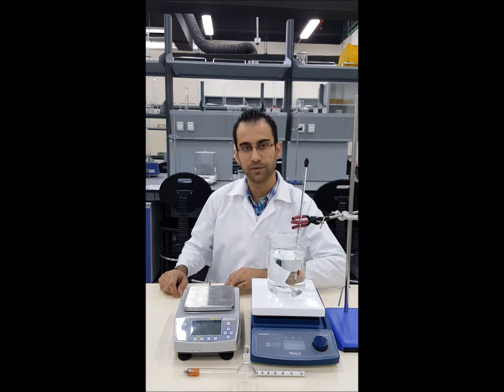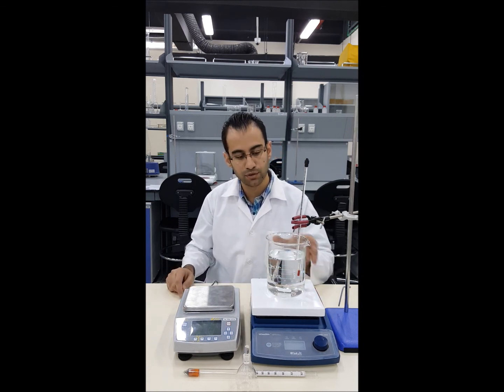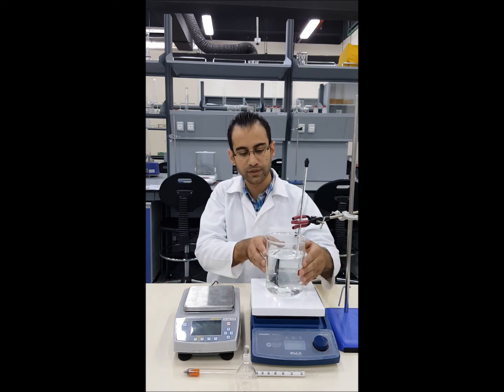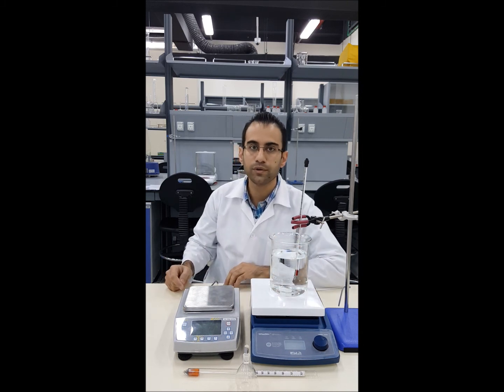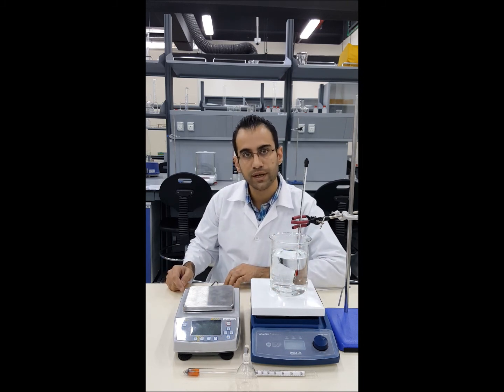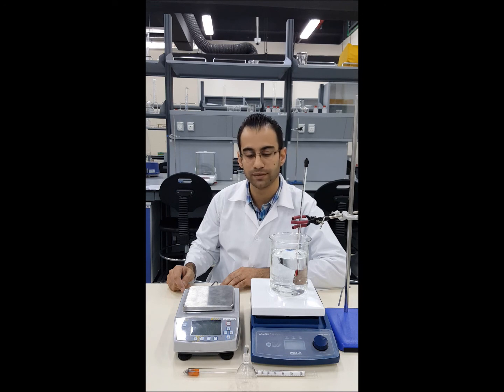For this experiment we are using a hot plate with a stirring function to heat 800 milliliters of water. We are going to measure the density of water at different temperatures starting from 20 degrees, then in increments of 5 degrees each, up to 50 to 60 degrees or when the water is too hot to handle.